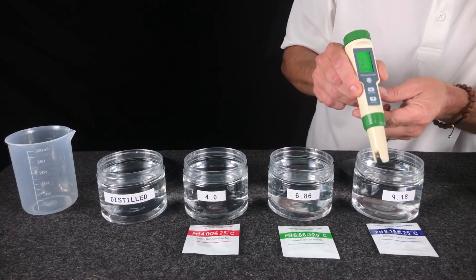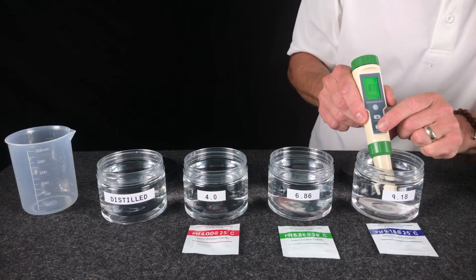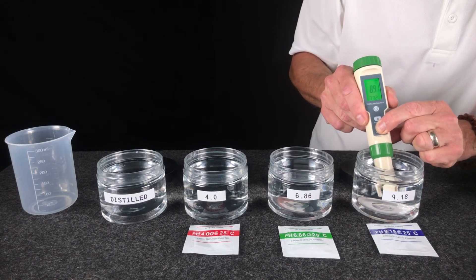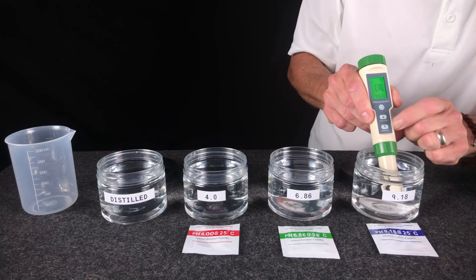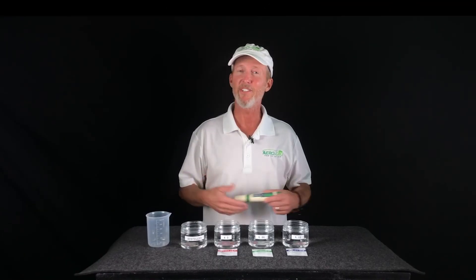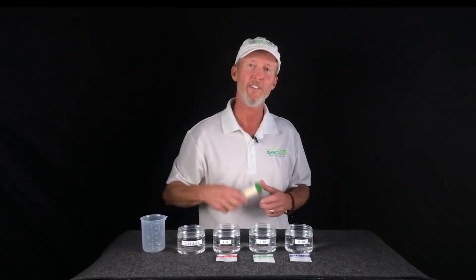Move on to 9.18 — dip into the solution, press and hold the calibrate button for a count of five. That's all there is to it. Calibrating your 5-in-1 meter couldn't be any easier.